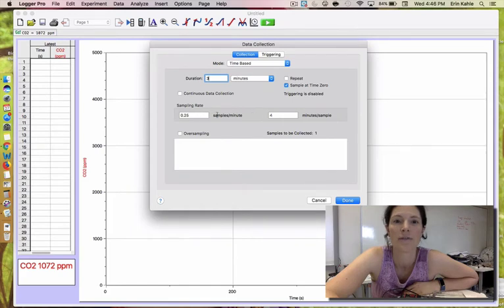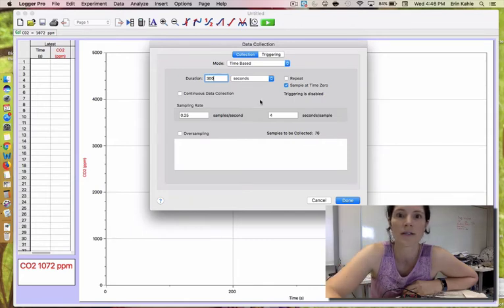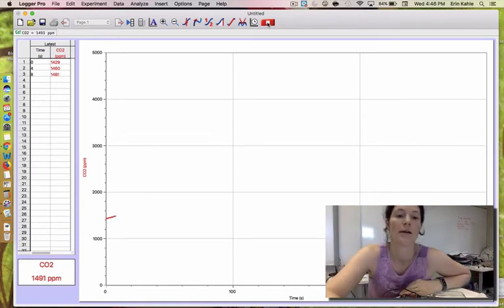that should be fine. Wait, no, let's do it in seconds, because taking a sample every 4 seconds makes a lot more sense. So let's just select for 300 seconds, and that should be good. As soon as you press start, it's going to start collecting your data. Then we should get a new reading every 4 seconds.